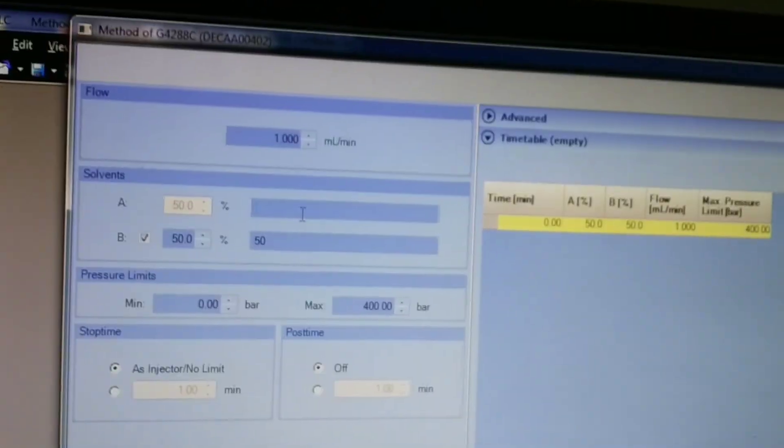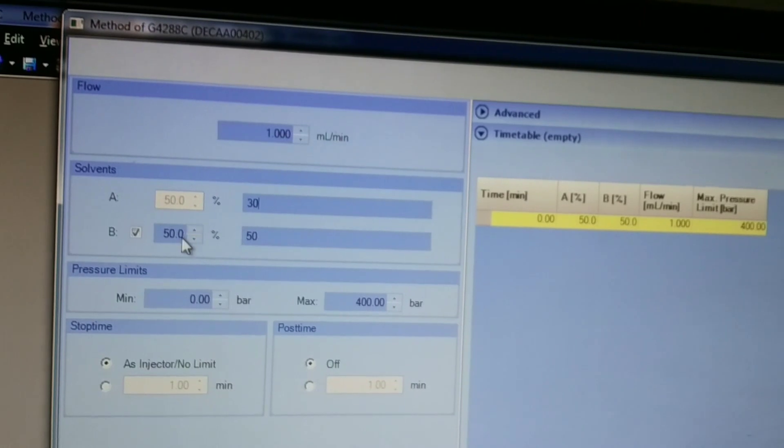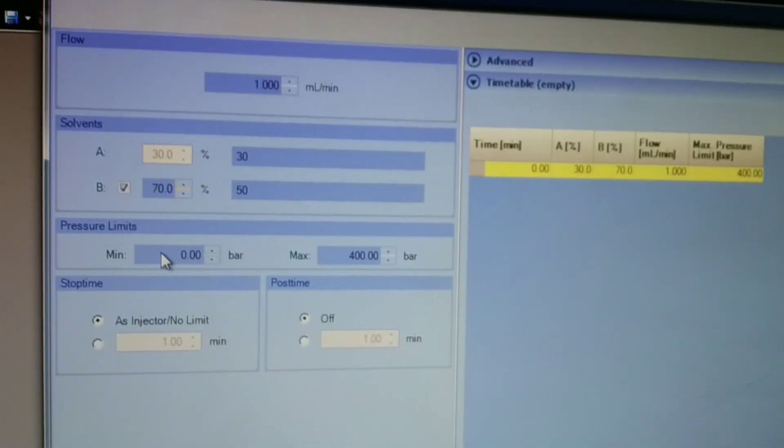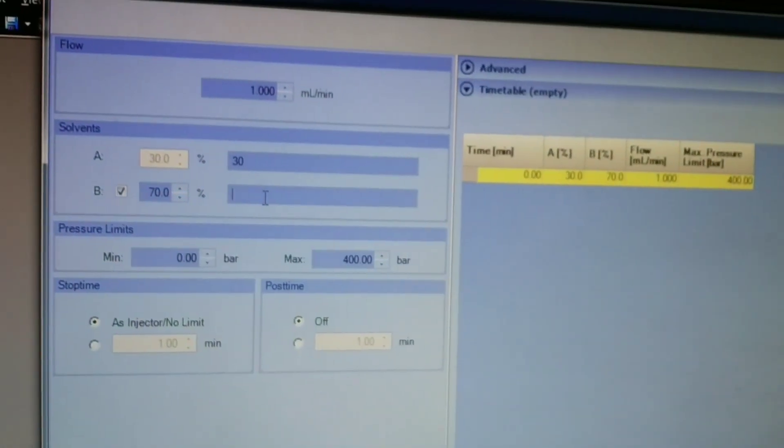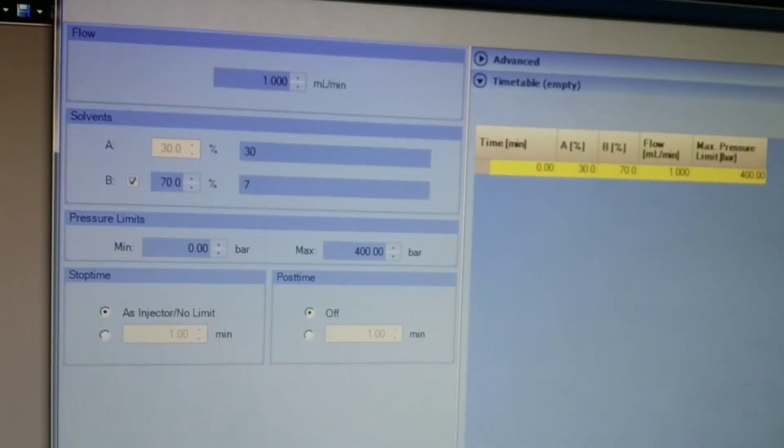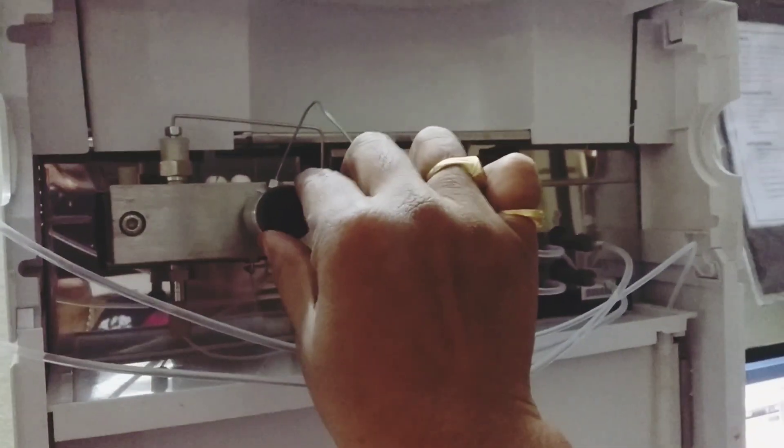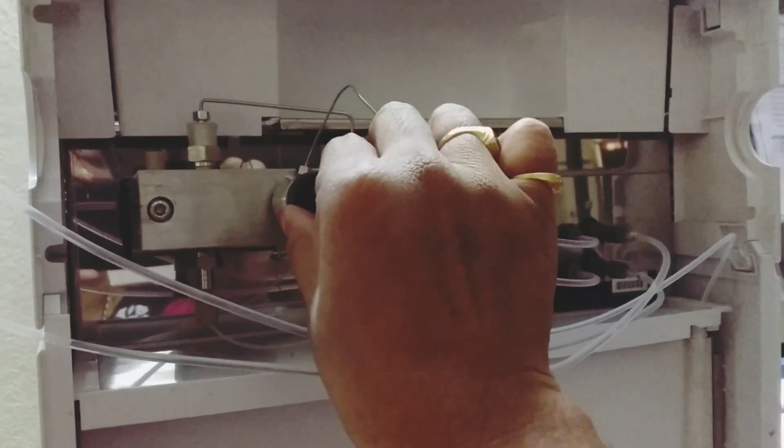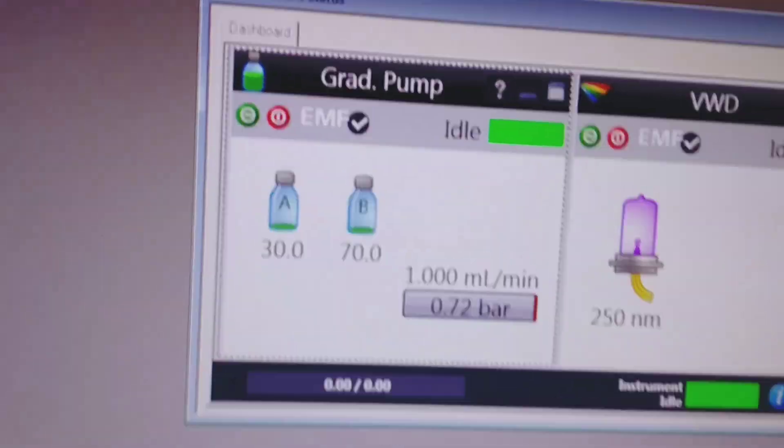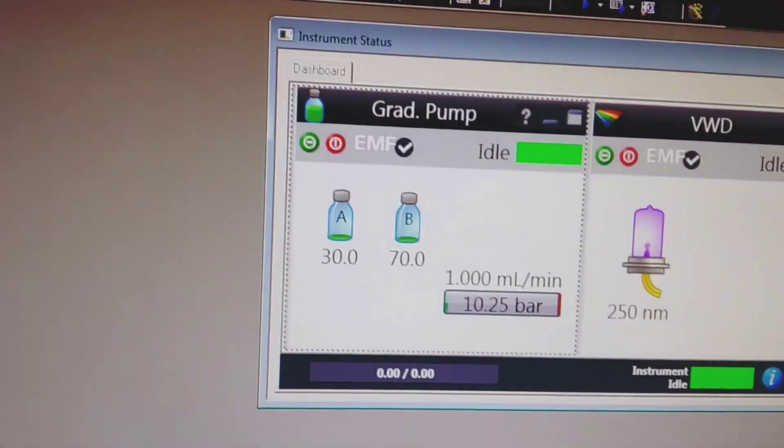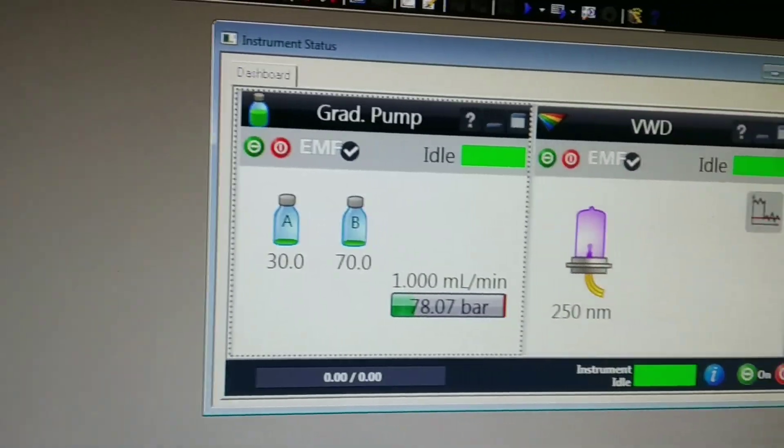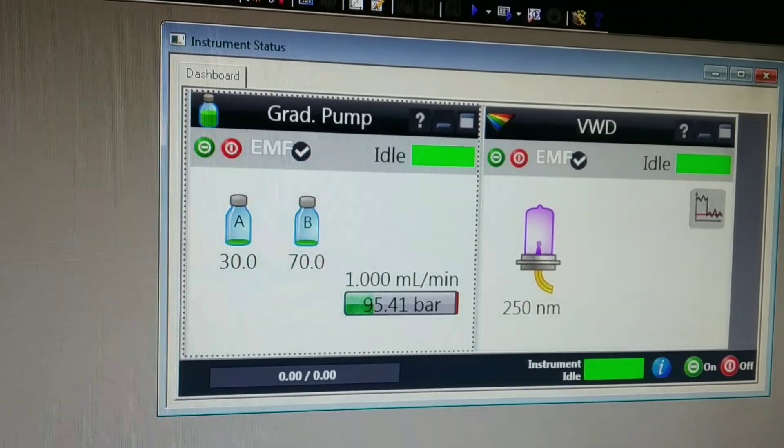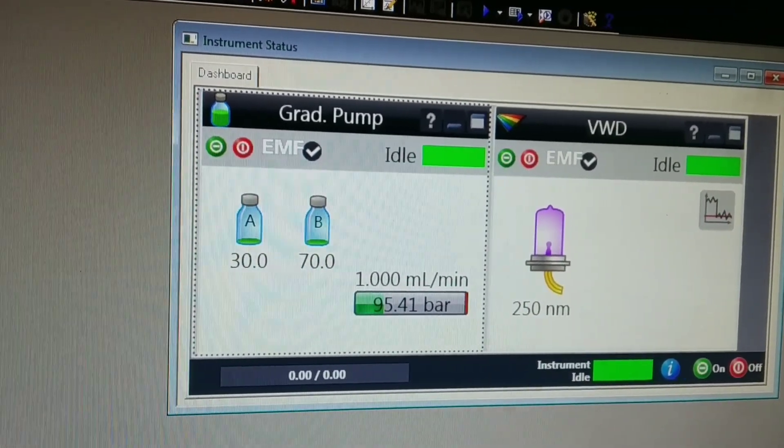Now I am switching to the next set of solvents like methanol and water, ran for some time, and then again closing the purge valve so that it goes into the column. You can see I have changed the mobile phase ratio to 30 percent methanol and 70 percent water.